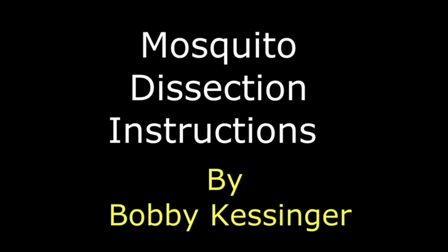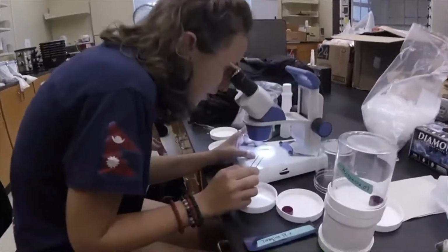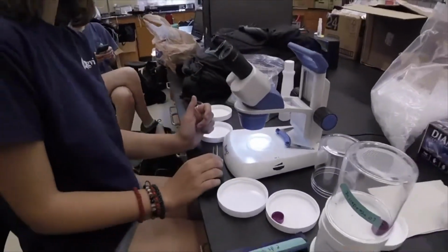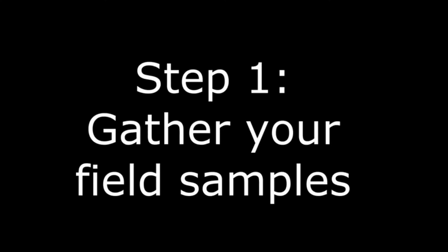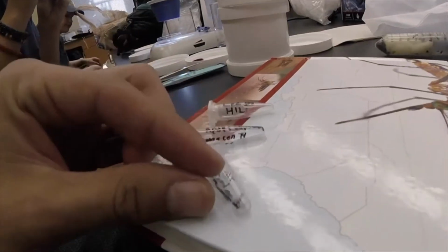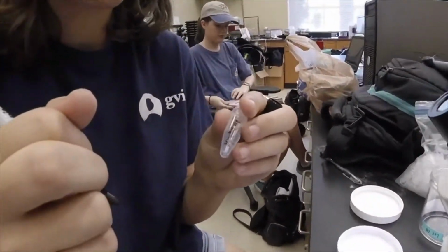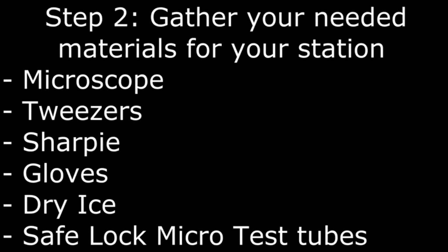Hey, today we're going to go over mosquito dissection instructions. Step 1. Gather your field samples. Step 2. Gather your needed materials for your stations, which are listed below.